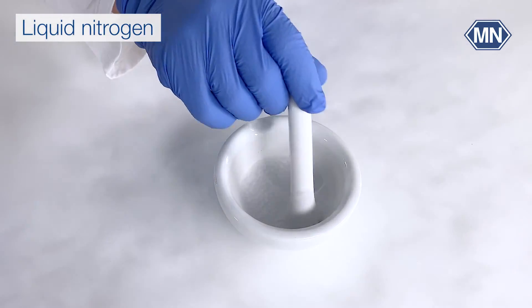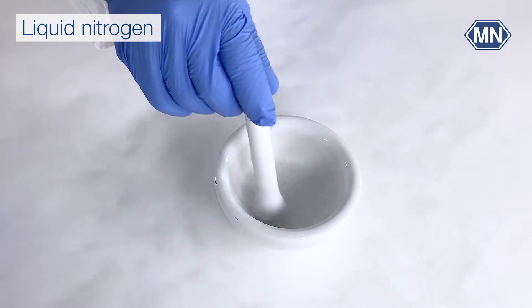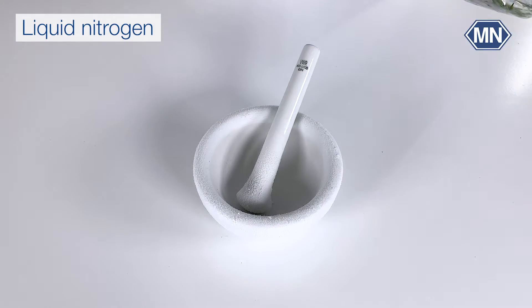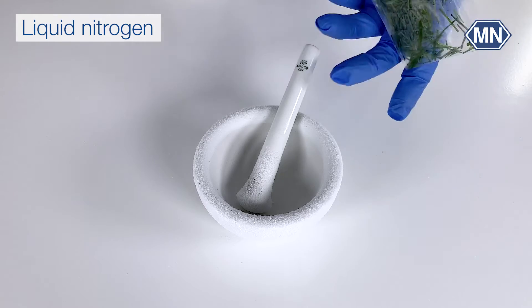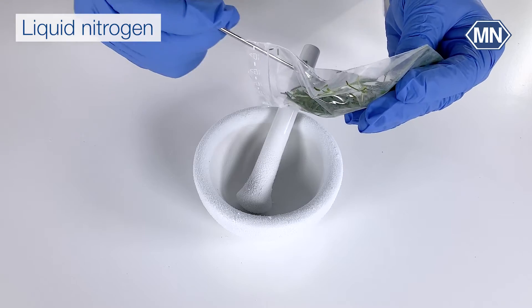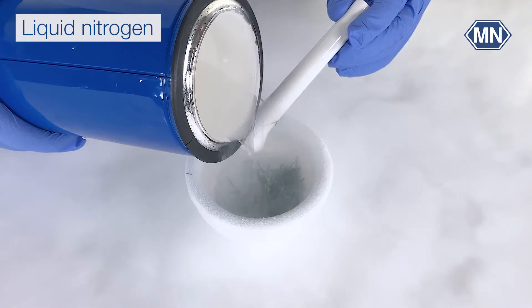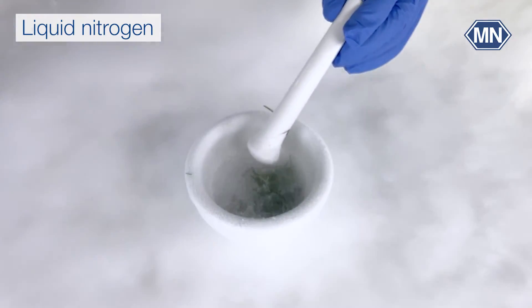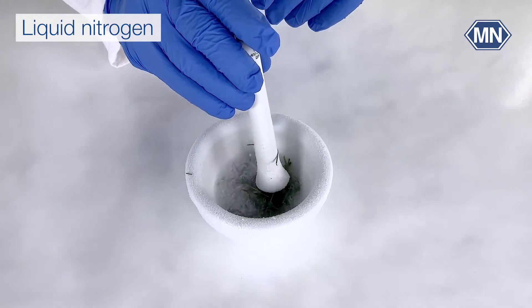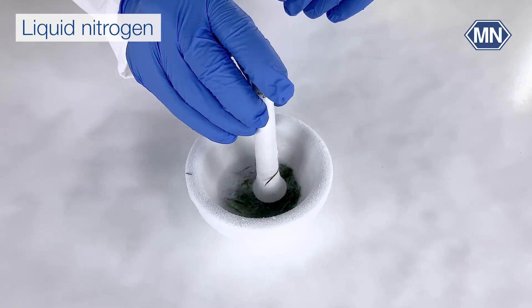Before starting the procedure, make sure to cool down the mortar and the pestle, for example with liquid nitrogen. Then place your sample into the mortar. Depending on your specific application, you may need to add a buffer or reagent to facilitate the grinding process. Using the pestle, start grinding and crushing the sample in the mortar. It's essential to apply consistent pressure while grinding in a circular motion. The goal is to break down cell walls and membranes to release nucleic acids.